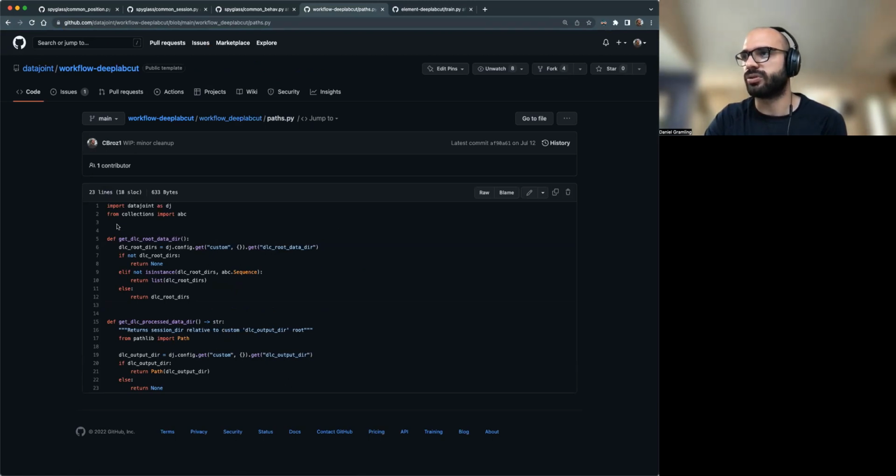I was wondering if your linking module has to have that command attached to it. Like, say if you're attaching it to an upstream table, do you need to have these methods as a method on those classes?